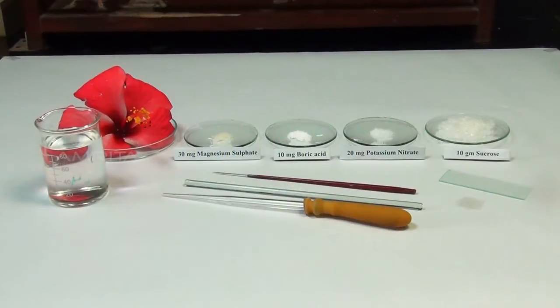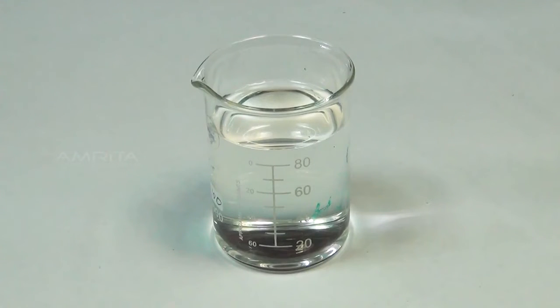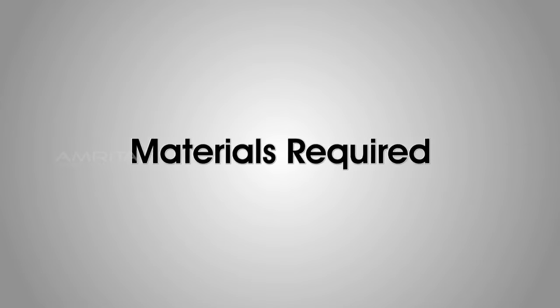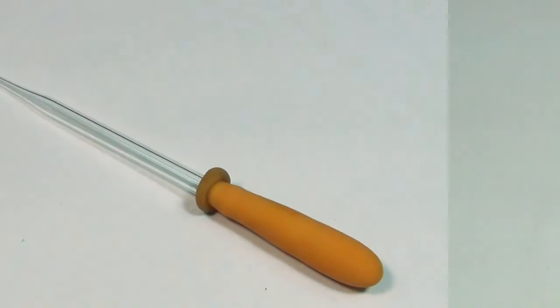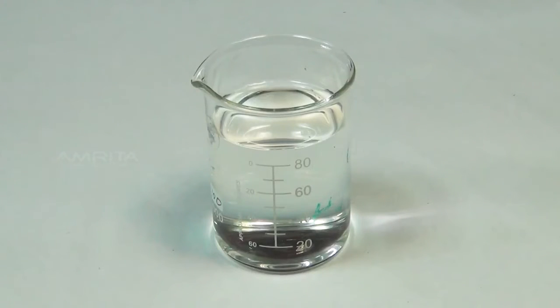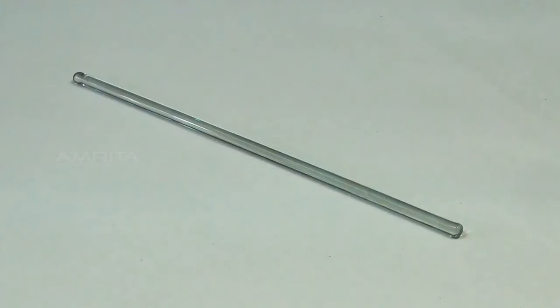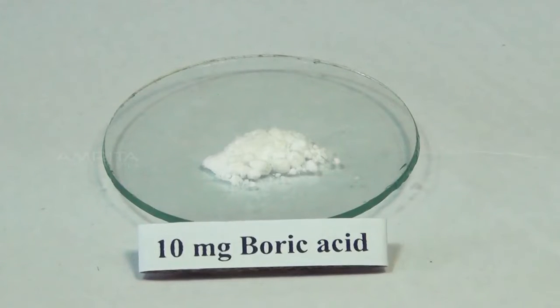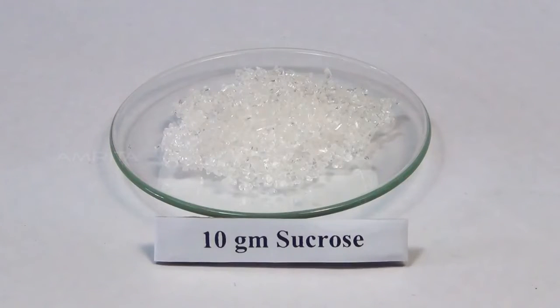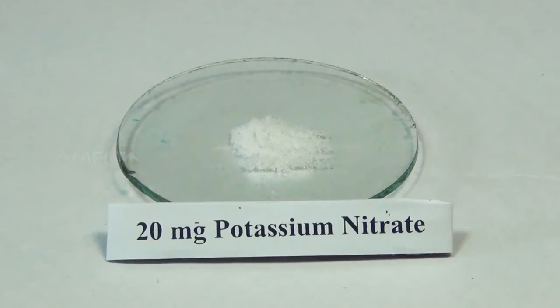Now, let's study how to stimulate pollen germination in vitro with the help of a nutrient medium. Materials required: fresh mature flower, dropper, beaker containing distilled water, glass slide, cover slip, needle, glass rod, compound microscope, 10 mg boric acid, 10 g sucrose, 30 mg magnesium sulfate, and 20 mg potassium nitrate.